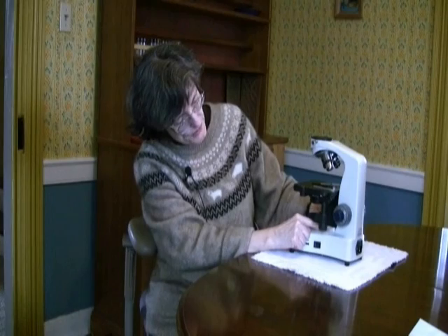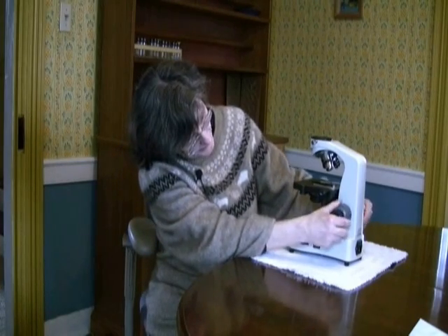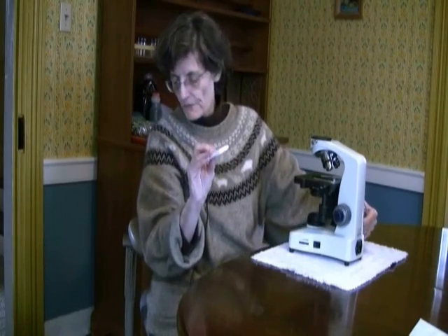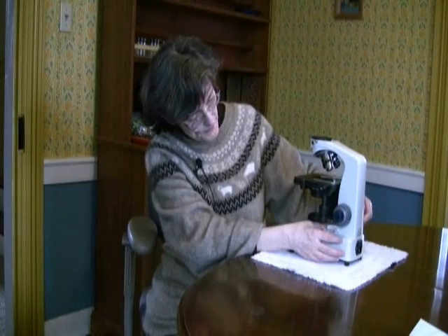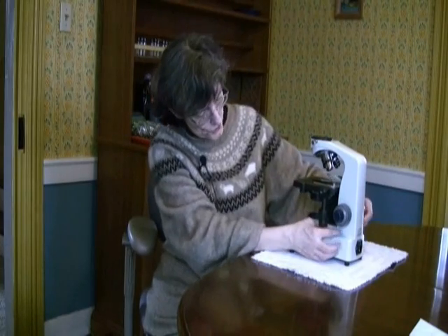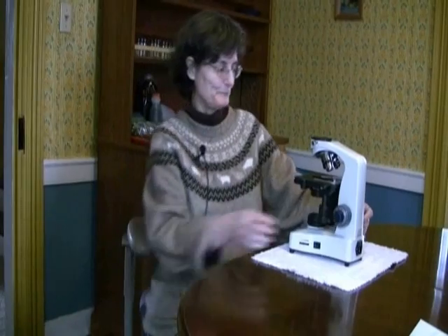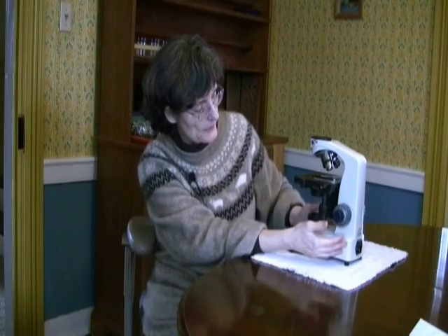The first thing you're going to want to do is pull that piece out from underneath there, and I'm going to get that out by moving my stage up. So now it's really easy to pull that little piece of styrofoam. Keep it though, because if you go traveling with your microscope, you're going to want to do the same thing. Put that little piece of foam in there and put your stage down so it's protecting your stage from being jerked and moved around in shipping as your microscope is thrown into the bottom part of the airplane. So any other pieces of styrofoam that might be in here, you'd want to remove.